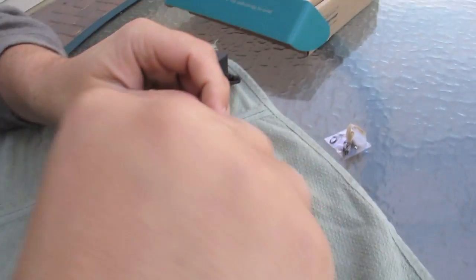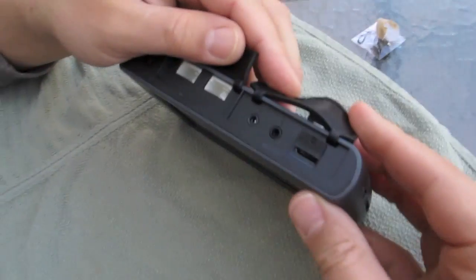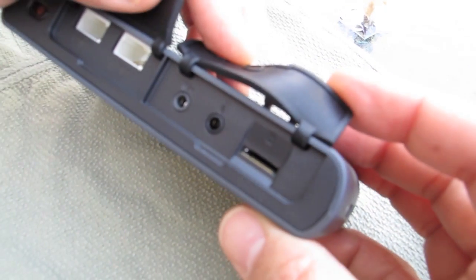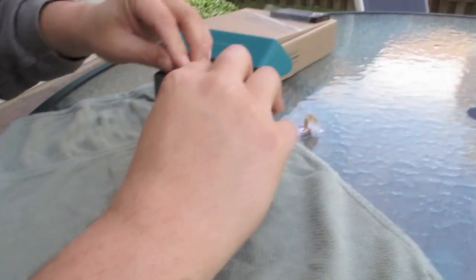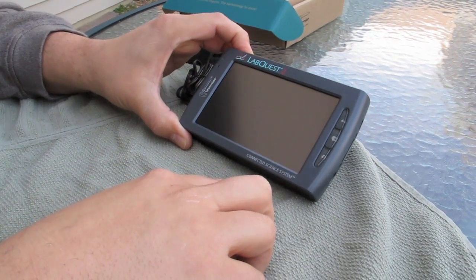These are just additional ports and the digital ports. And then we have a headphone jack, a microphone jack, and a little tiny micro SD card — so you can save data and other stuff there. So let's turn it on. I haven't played with it yet — we're just going to power it up and see where it goes. Connected science system.